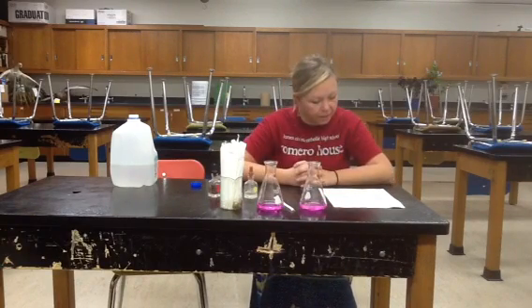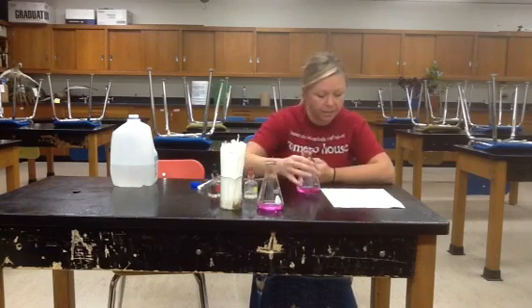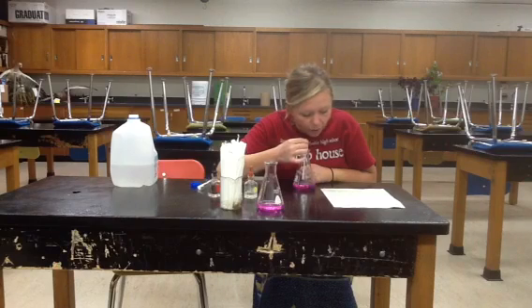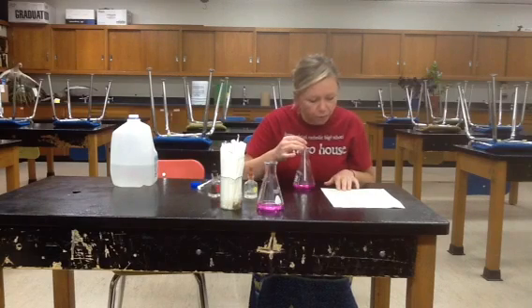So what you'll do is you're going to sit quietly for 2 minutes. This is where your timer comes into play. So I'm going to just expedite this, and we'll say that I've been sitting for 2 minutes. You're going to put a straw into the experimental flask, and you're going to steadily blow bubbles into the water for 20 seconds. You'll notice that the solution loses its pink color. So do this for 20 seconds.